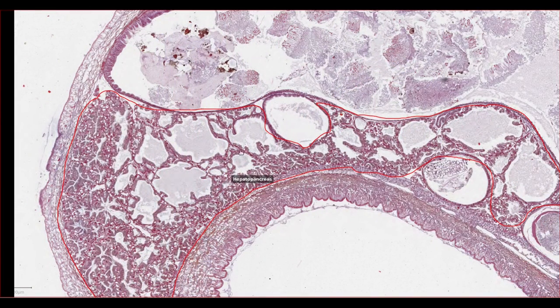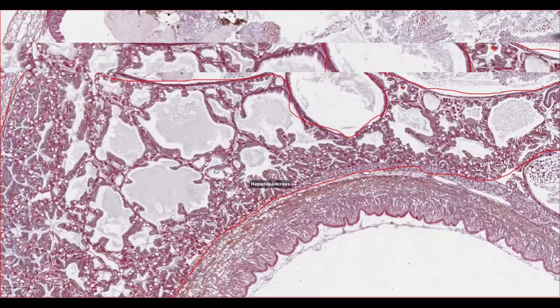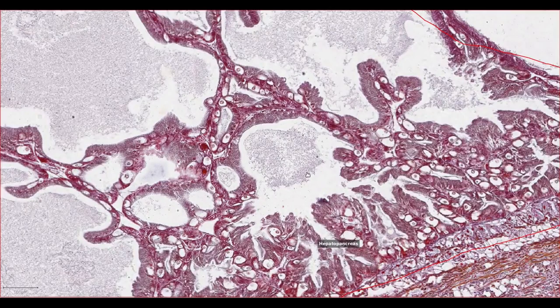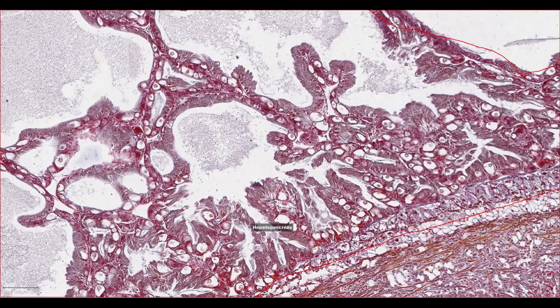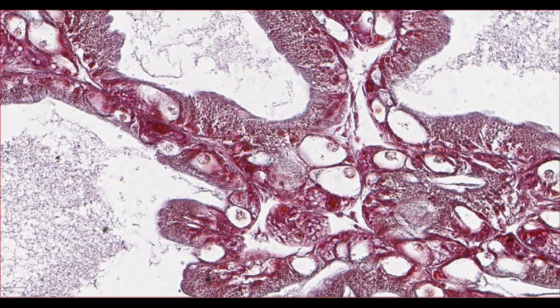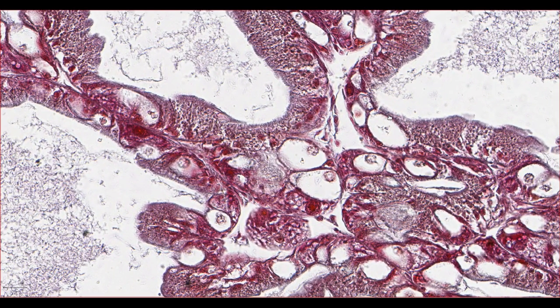Next to the intestinal tract, there's another large organ with lots of smaller lumens. This is the hepatopancreas. We saw in another video that arachnids also have an organ called a hepatopancreas, which looks quite similar in that there are lots of large cells with a very granular cytoplasm, like these ones here. While the hepatopancreas in snails also has a role in digestion, I doubt that these organs are completely analogous, since arachnids and snails are so distantly related.